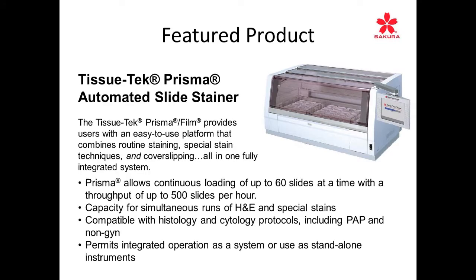At this time, I would like to ask Skip some of the questions that came through. Skip, are you ready? Yes. Okay. It says, is staining of RBCs an error? Is there a way to prevent RBCs from taking up the silver?